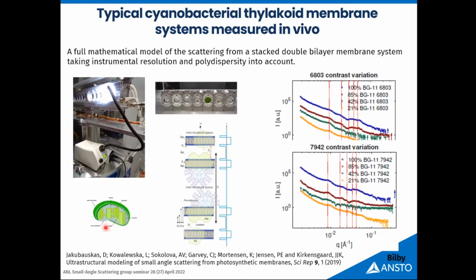And again, systems like that are massive. It's an entire living system. Whatever is in there scatters. But having a system like that is kind of lucky because you know that the only ordered component is the component you want to look at. Once you have this order, you have your peaks, and then you can analyze them basically without bothering too much what else is in there. So it's really very nice to focus on all you want and ignore all the rest. Anyway, that was a fun one.